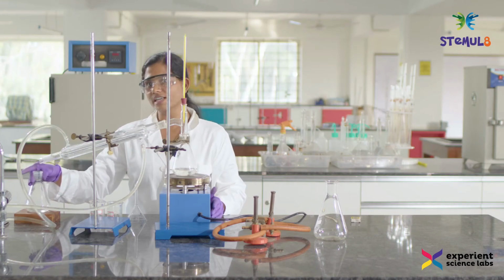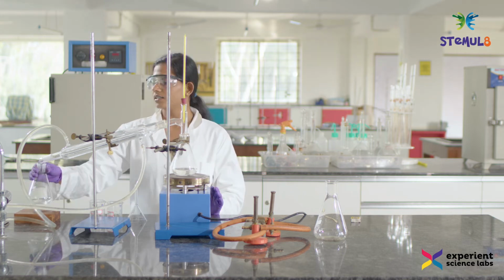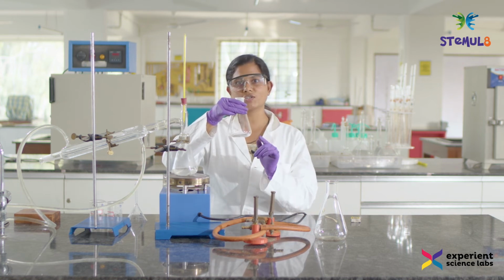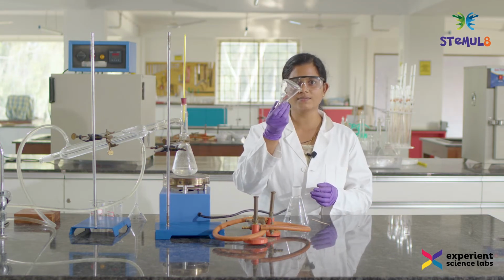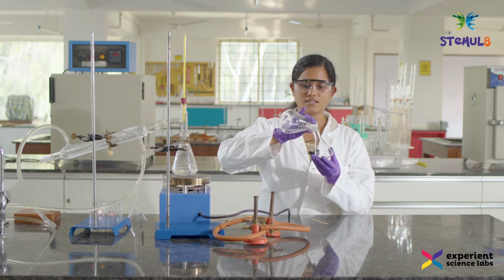However, we can also test whether what we have collected is ethanol or not. Let's test this ethanol. And how do we test this? There are multiple ways to test ethanol, but we'll do something interesting. This is an empty conical flask. So I'm going to add a bit of ethanol into this.